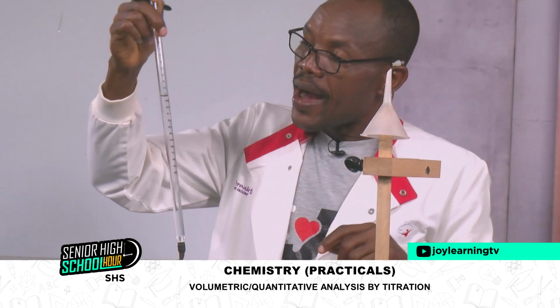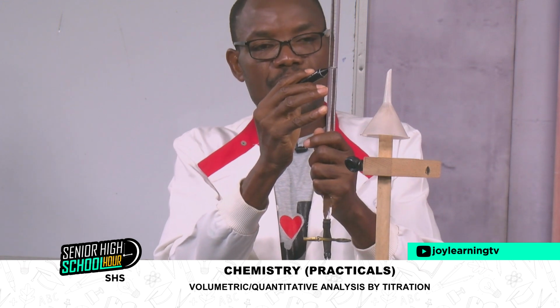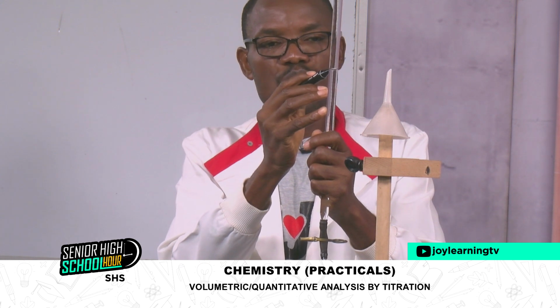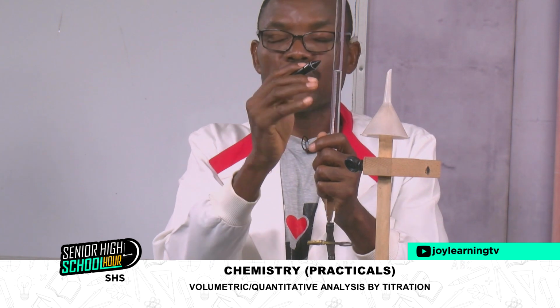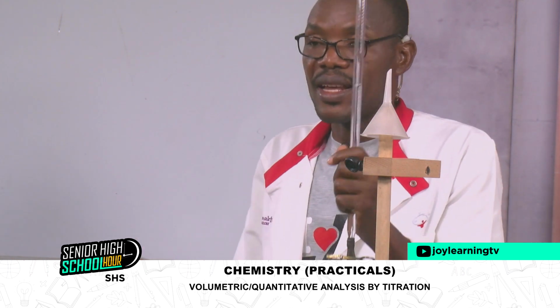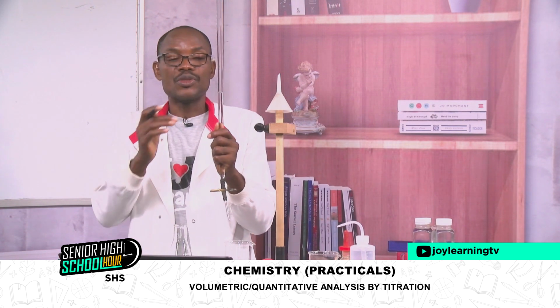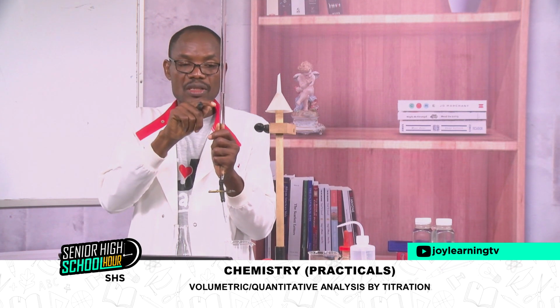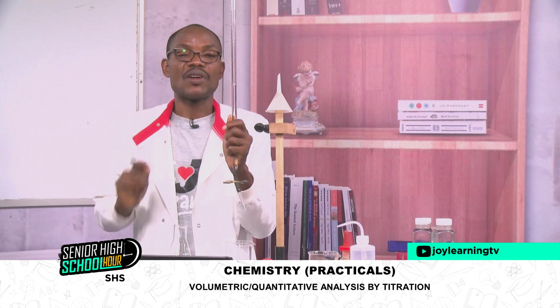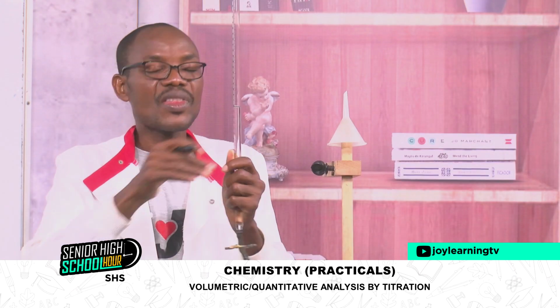But for colored solutions, the down part of the curve is so dark that you may not be able to see any reading to read. Because of that, you read on top of the meniscus. That is clear enough for you to take the reading. So for colored solutions, you read on top of the curve, that is the meniscus. For colorless solutions, you read at the bottom of the meniscus because it is clear for you to see the calibration.